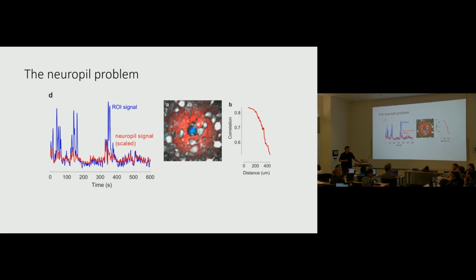The other one is, in which case, what's the ground truth, what's the criteria of judging if the algorithm already decontaminated the neural signal very well? Yeah, very good question. If we did, we'd really like to know that, but we're not very sure.